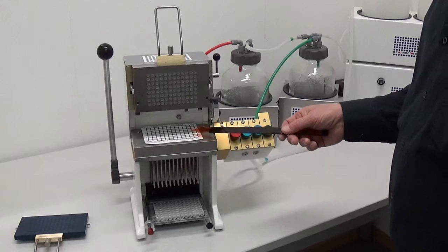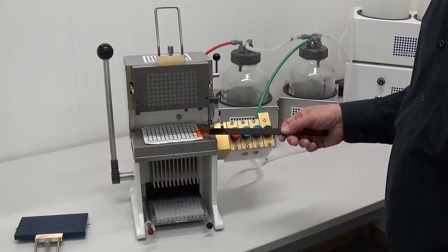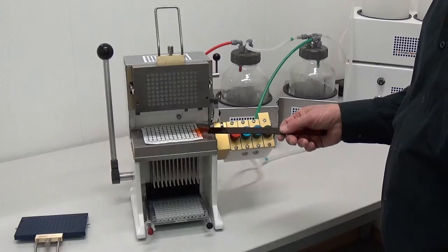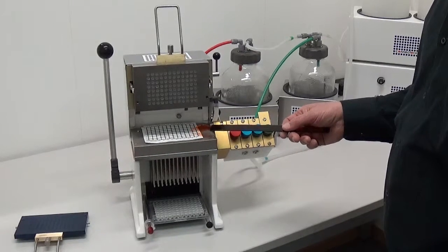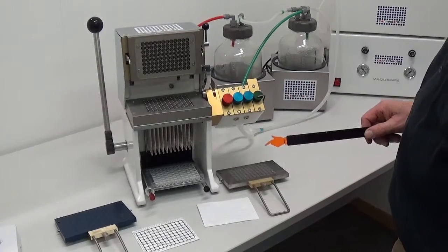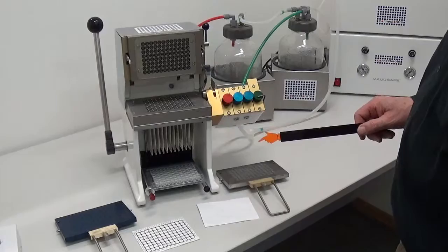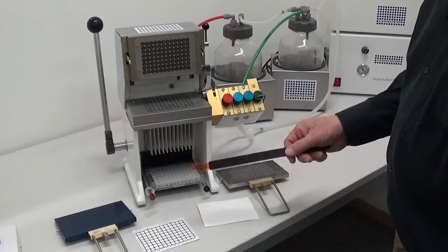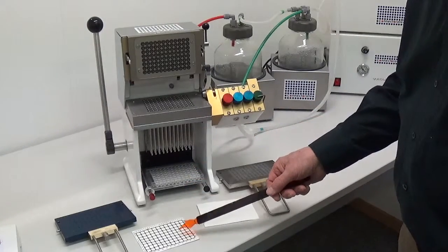These filters are then washed free from unbound materials in a second step. The operation of the harvester depends on the filter you want to use.